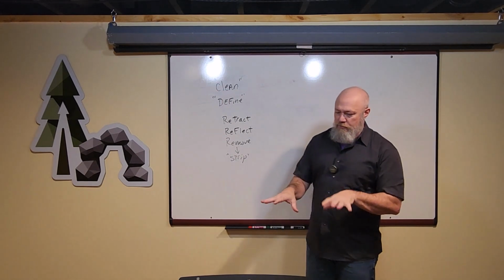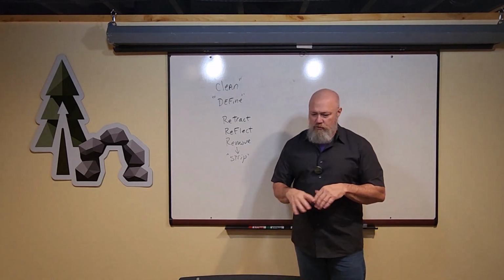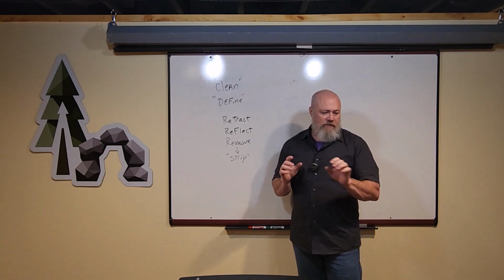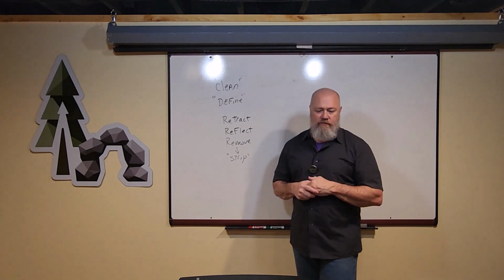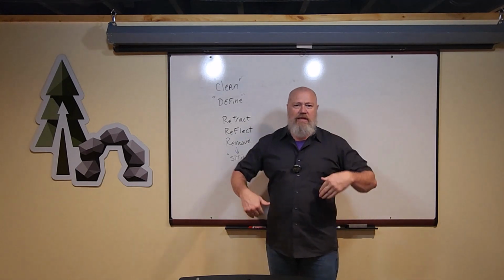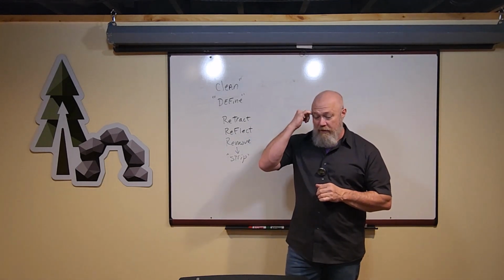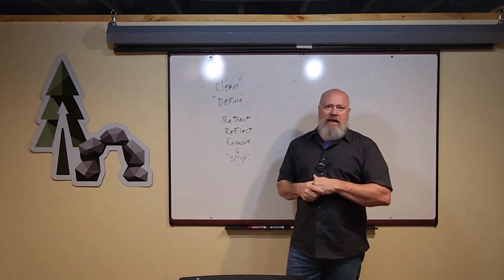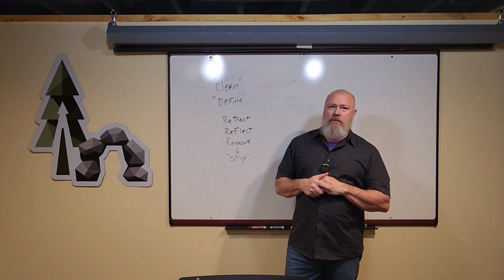You're going to need a few simple tools, some sharp and blunt tools. Tags are handy. Some PPE: gloves, maybe some goggles or a face shield if you're not wearing eyeglasses. And you obviously have to have a lab coat and closed-toed shoes to be in one of my courses. Then there's pans, specimen trays, and buckets and such.